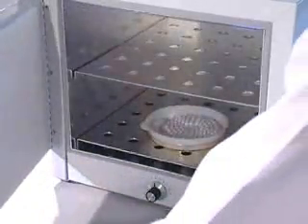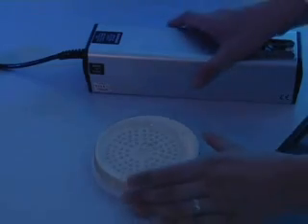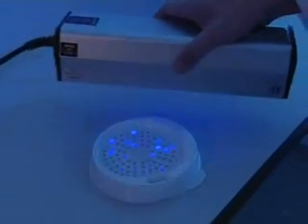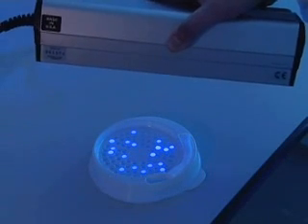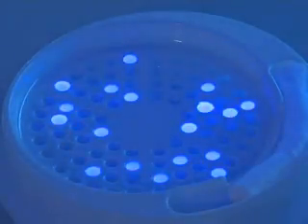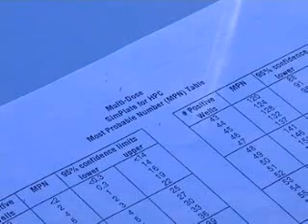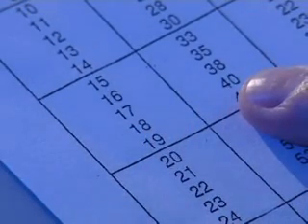After 48 hours of incubation, read the results of the SimPlate test as follows. Remove the cover and count the number of wells showing any fluorescence by holding a 6-watt 365-nanometer UV light 5 inches (12.5 centimeters) above the plate. Face the light away from your eyes and towards the sample. In this example there are 18 positive wells. Refer to the MPN table provided to see that the most probable number is 40 heterotrophic bacteria per milliliter in the original sample.